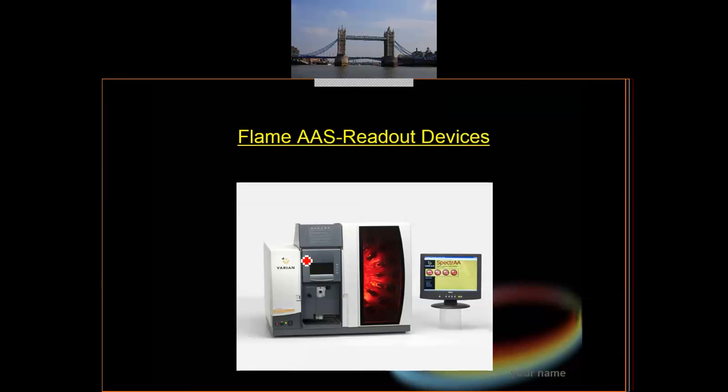Actually, that's it. Done. We have covered the AAS. Starting from the principle, please remember at least 3 of the principles, and then we look at the machine itself, the compartment, not to see how it works, but what are the components inside the AAS.